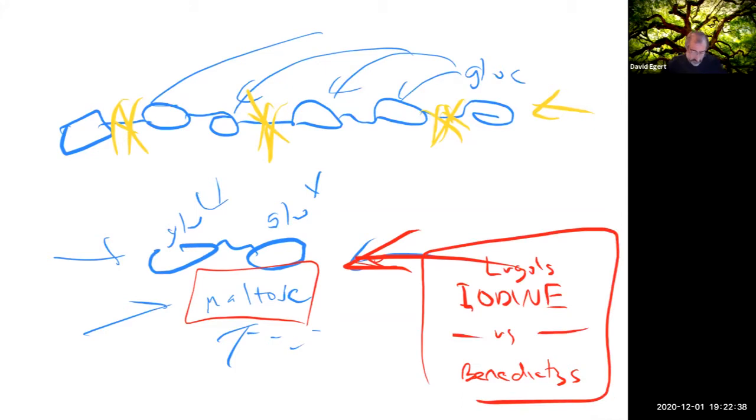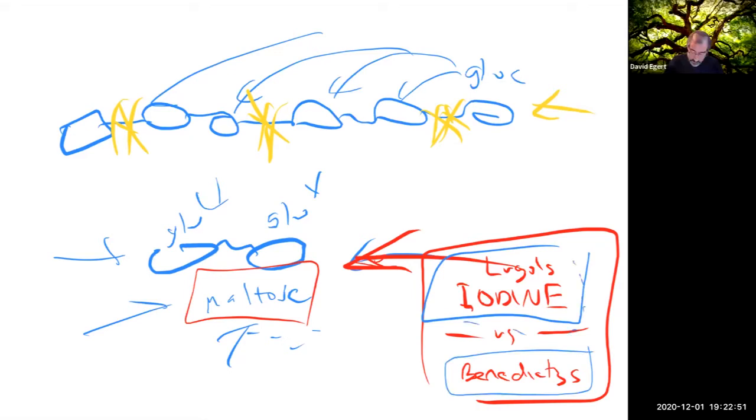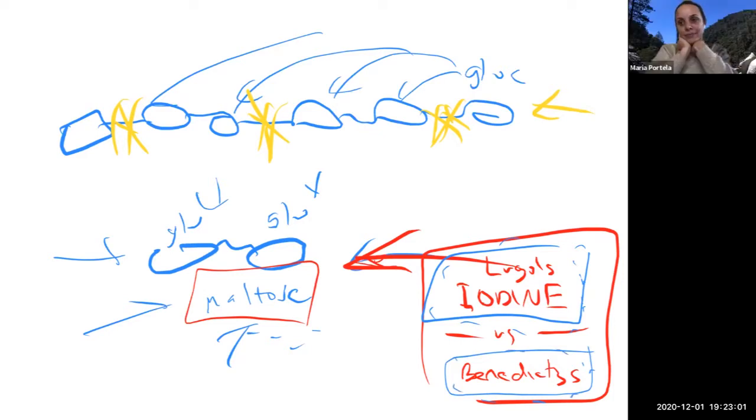Let's say there was no digestion at all that happened with the starch. What would I expect to see with these 2 tests? It's going to be blue, dark purple. Yeah, it would be dark purple for Lugol's iodine because that means there's lots of starch. And for Benedict's, it would be blue. It's a negative, meaning there's no sugars.